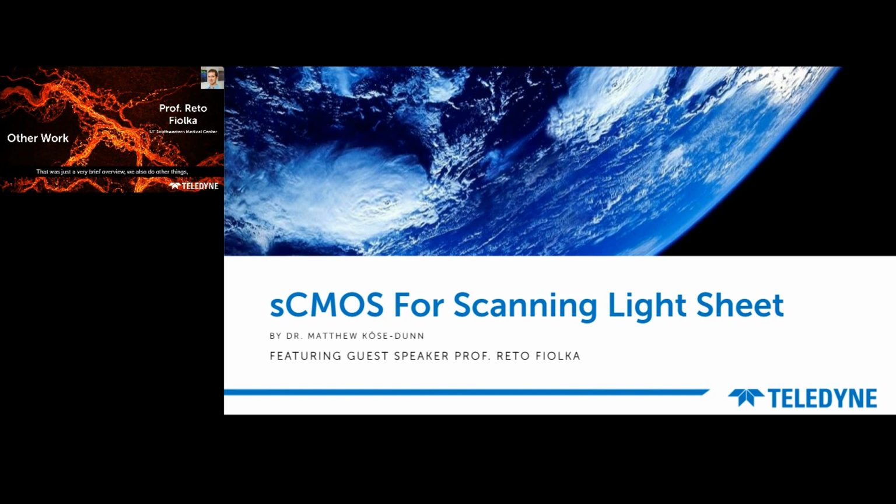We also do other things, developing new ways of launching the light sheets with a so-called single objective light sheet microscope, also known as oblique plane microscopes or SCAPE microscopes. Those are technologies that use a single high-NA lens to launch the light sheet and also detect the fluorescence light.